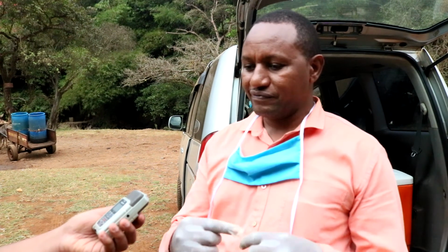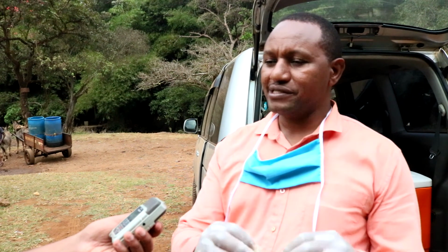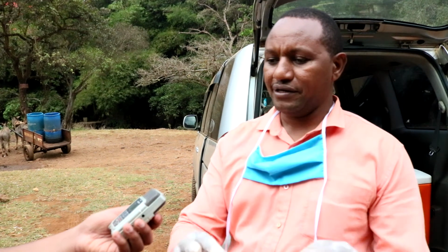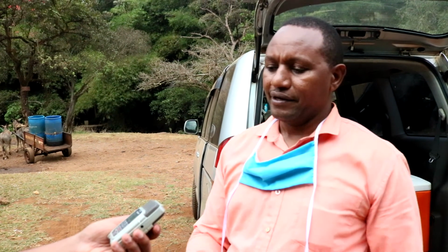Then because it's going for testing in the laboratory, we have to label that sample. We indicate the date when we collected it, and then we put the tag so that we can know which market that we sampled. And that's why we are writing this, so that we can be able to know where we collected the sample. So after we label very well and we seal it, we keep it in a cooler box with ice. And why we are doing this is to maintain the quality. We don't want to destroy any of the chemical component of that kale. So that's what we'll do. We'll seal it and then we put it in the box.